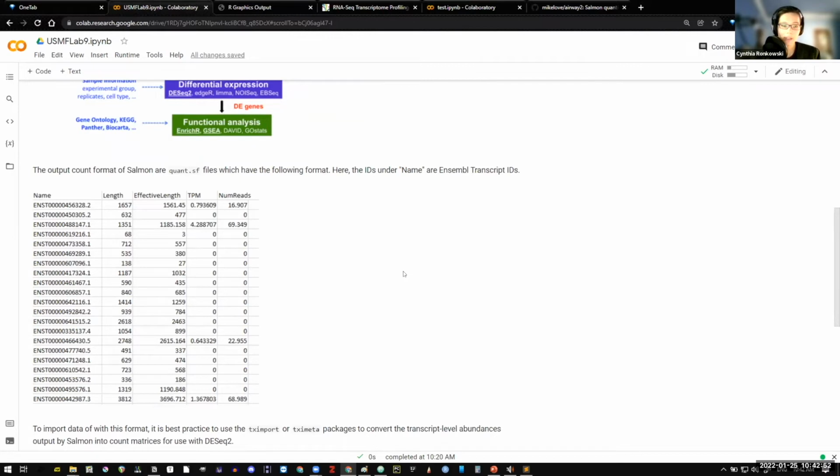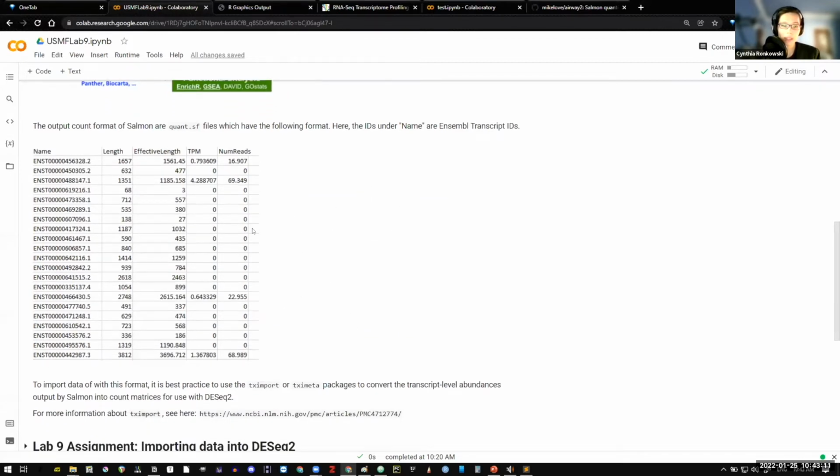Instead, it uses statistics to compare profiles, and based on those statistics, it generates a sort of theoretical number of reads, which itself isn't a whole number.